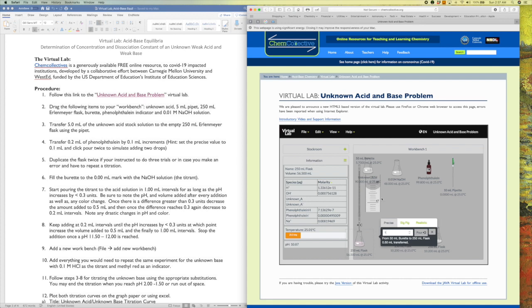We're at 46.3 ml that we've added, so there's not much left, right? So now we added another 1 ml. So the pH is still going up, but it's still not at 11. We still have more, so let's pour another 1 ml.